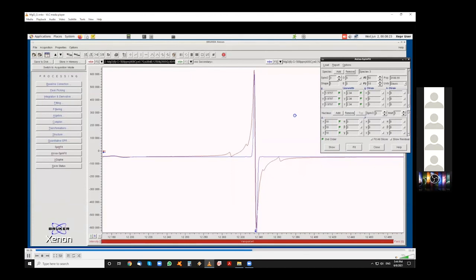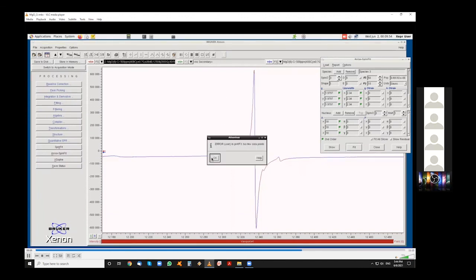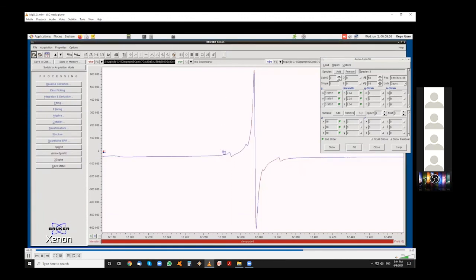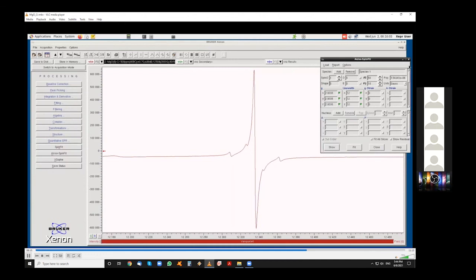With this simulation, I realized that the time has increased too much, the time when the program is trying to optimize all the parameters at once. So after a while, I decided to stop the operation using this button here, and try again. This time optimizing fewer parameters at once.